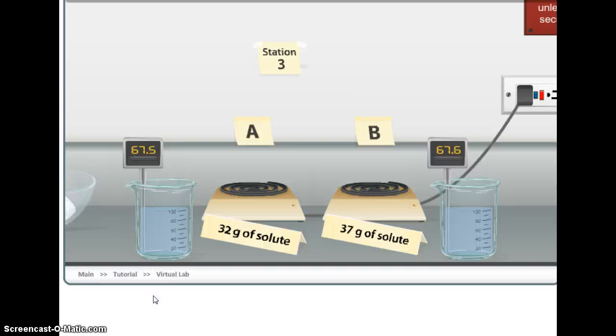Therefore, they are having more collisions. Therefore, dissolving will be faster, and you can dissolve more. Okay, there's more craziness going on, so it can spread the chemical out even more. Now with this, we're cooling off to see at which temperature we can no longer dissolve this much of the chemical. So I want to check back in over here with our data, and we're right at around 66 degrees.